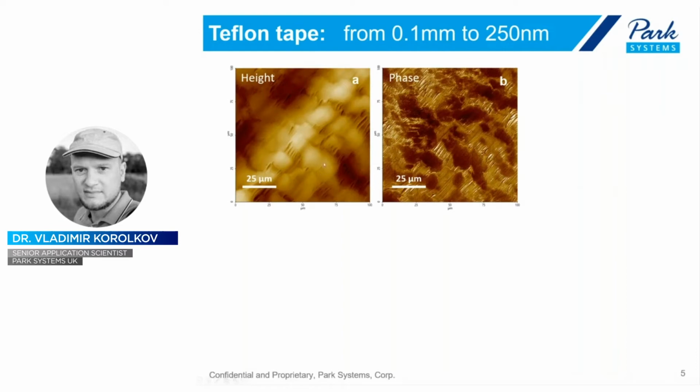detail-rich image of areas with a dense sort of structure and some rope-like structure that connect them. Equally, you can see the same sort of information in the phase image. We can probably agree that most of the crystalline and semi-crystalline areas are located within these dense areas.